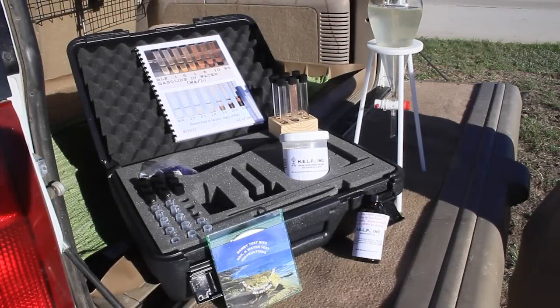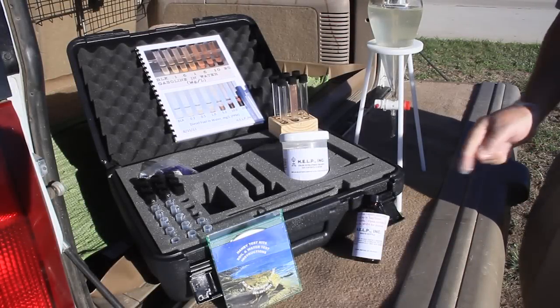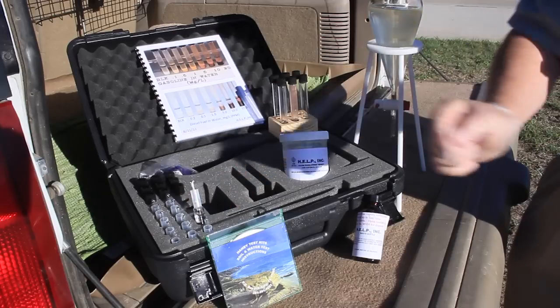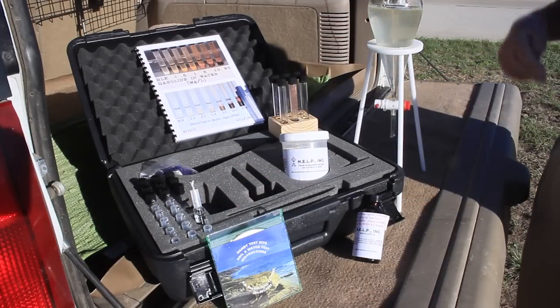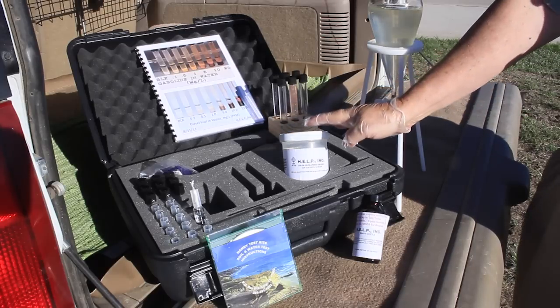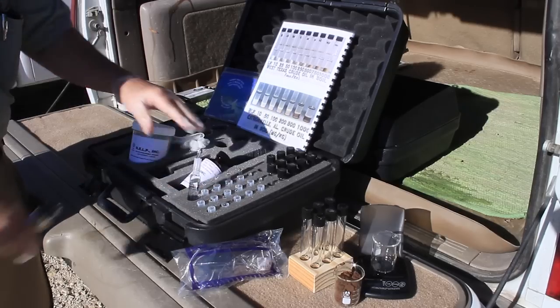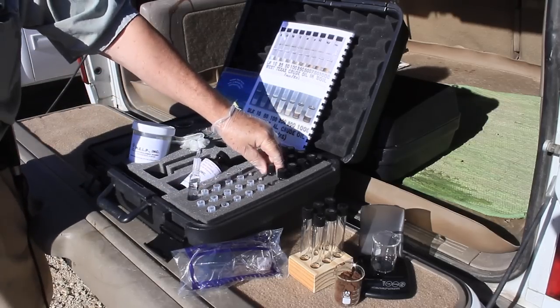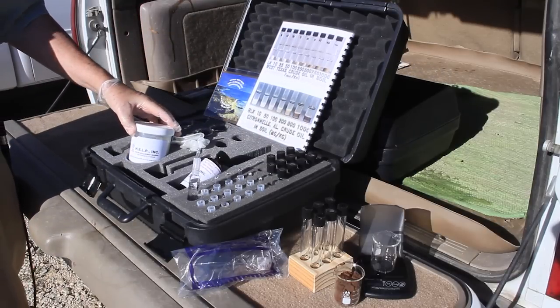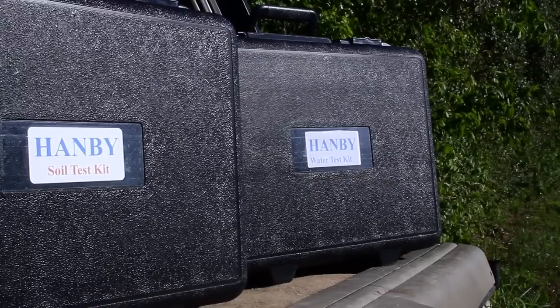In this video, we will take a look at the simple procedural steps for soil and water analysis. All necessary apparatus, reagents, and calibration photo booklets are contained in the kits, along with a CD that provides comprehensive video instructions. The kits are rugged and have been used in the harshest of environments, including the pitching decks of research vessels, Arctic tundra, and Kuwait deserts.